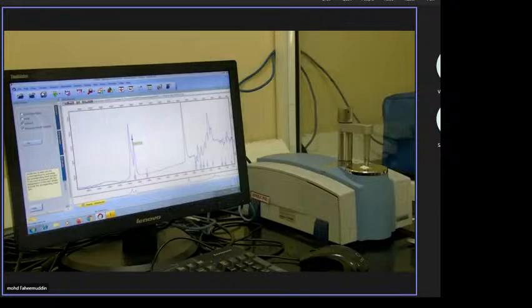If it is a new compound, and you are designing and carrying out the reaction for the first time, how can you say whether that reaction proceeded or not? You can do it by using FTIR. For example, if you are doing an acetylation reaction, you will get the acetyl functional group, so you will definitely get its peak. If that peak is present, then your reaction is maybe completed.